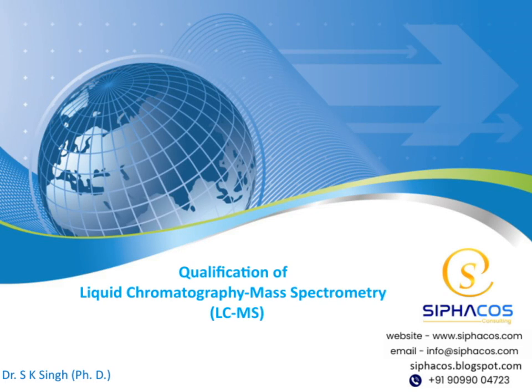I am pleased to present to you a detailed overview on the qualifications involved in liquid chromatography mass spectrometry, or LCMS. Today's session is titled Qualification of Liquid Chromatography Mass Spectrometry, LCMS, and it's designed to give you a clear understanding of this powerful analytical technique. Over the course of this presentation, we will explore the fundamentals of LCMS, its applications, and the key qualification processes to ensure accurate and reliable results.